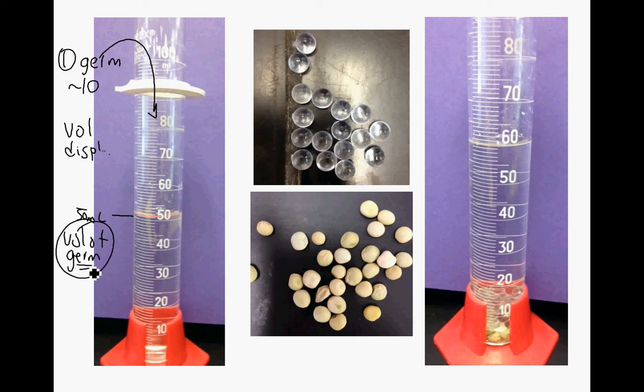Then, after that, you're going to take the same number of non-germinated seeds, around 10, and put those into another graduated cylinder. The volume of these non-germinated seeds is going to be less than the volume of the germinated seeds, simply because the germinated seeds are going to be larger. So you need to make up the difference in volume with these glass beads.